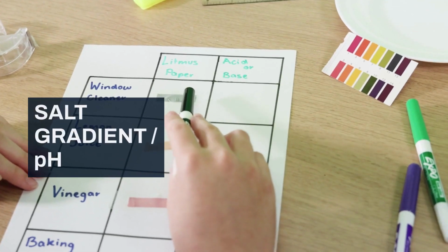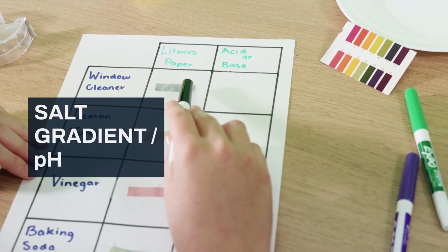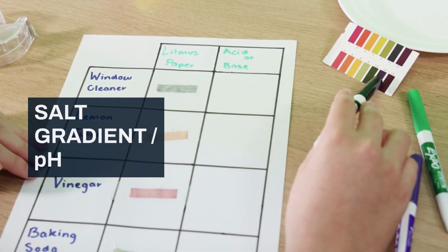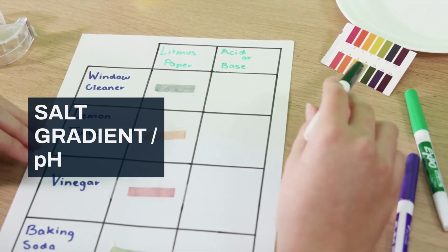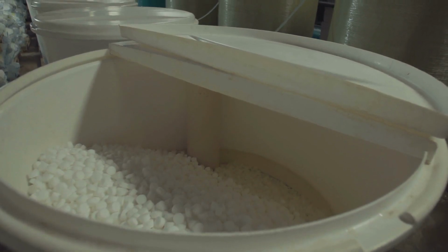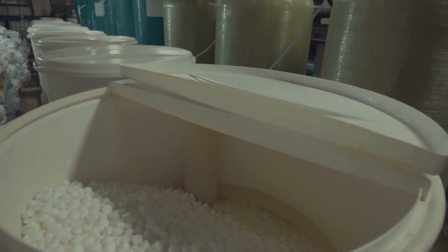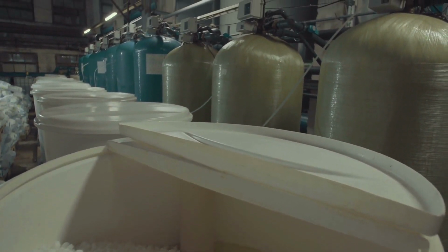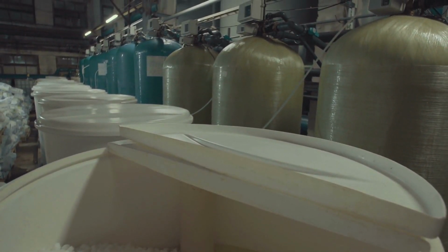Specifically for ion exchange chromatography, there's often an additional line on the graph. This line typically shows the salt gradient or the pH change that was applied during the separation. In ion exchange, molecules bind to the column based on their charge. To elute them, you usually increase the salt concentration or change the pH. The salt ions compete with your bound molecules, causing them to detach and elute.